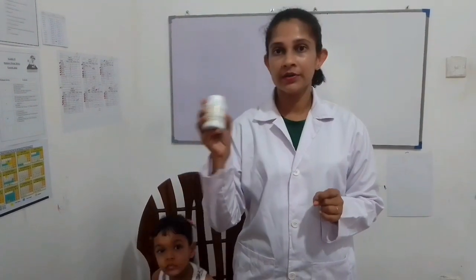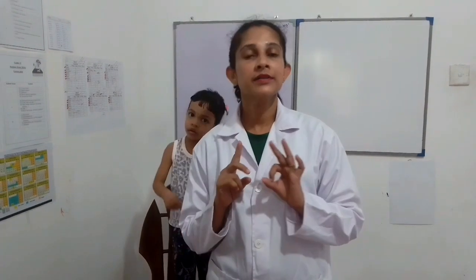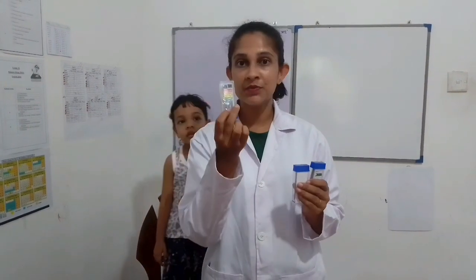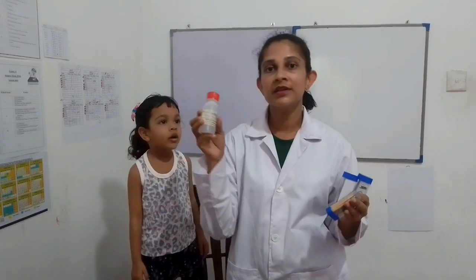Today I am going to perform activity 8.17 in the grade 8 science syllabus, grade 8 lesson 8, changes in matter. I am going to prepare sodium hydroxide solution, sodium chloride solution, which is the common salt we use in day-to-day life, and dilute sulfuric acid solution. Then I will try them with red litmus paper, blue litmus paper, pH papers and phenolphthalein indicator.